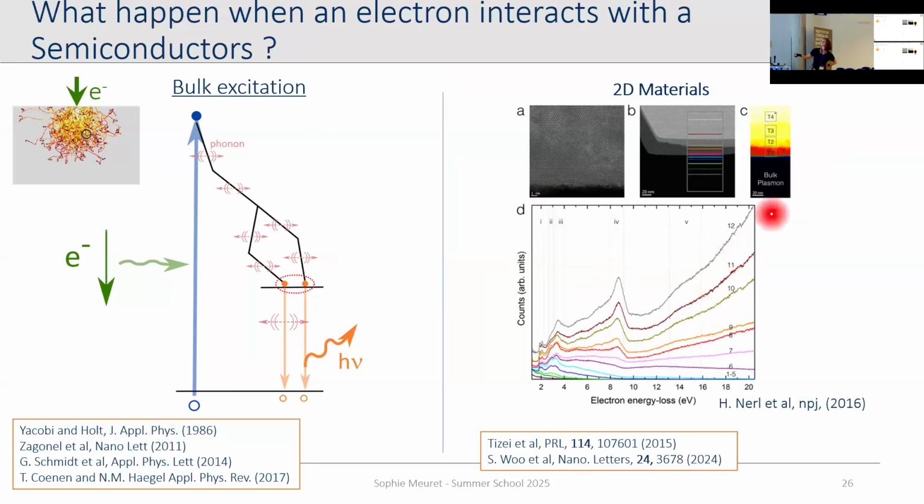And here it's the beginning of the bulk plasmon, and you see that it's huge compared to those really, really small things here. You're exciting a plasmon, and then the same electron beam is picking up the signal from this. Yes, true. But in this case, if you look at your EELS spectrum, you will see only excitation of a bulk plasmon. But you will see excitation from the exciton if you look at the optical property.